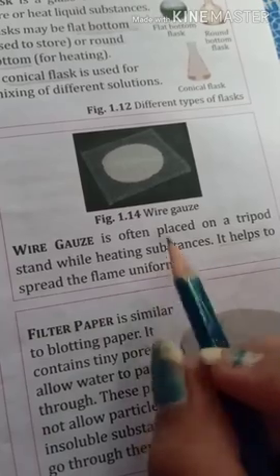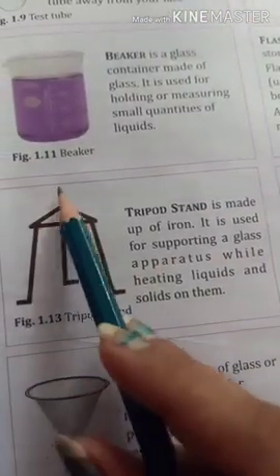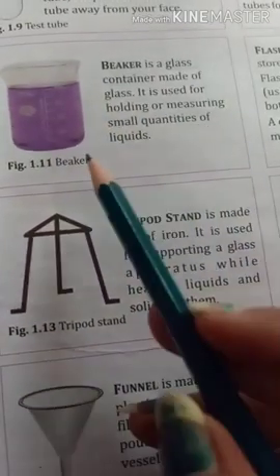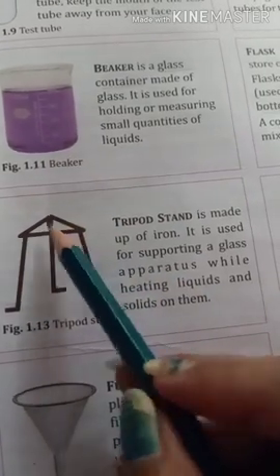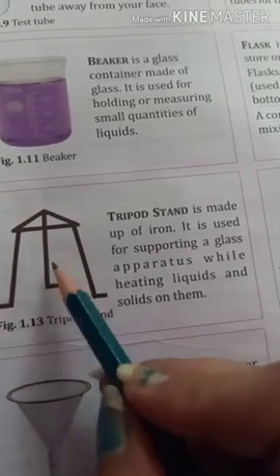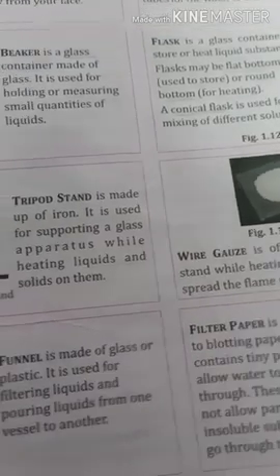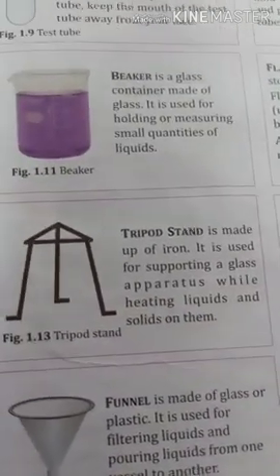So what we do, we just place this wire gauze over this tripod stand, and then we place any apparatus, like we place a beaker with liquid upon this wire gauze, and from this side we will heat our liquid. So this wire gauze is used in heating, we can say.